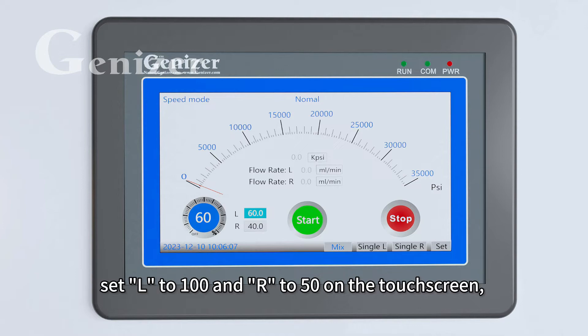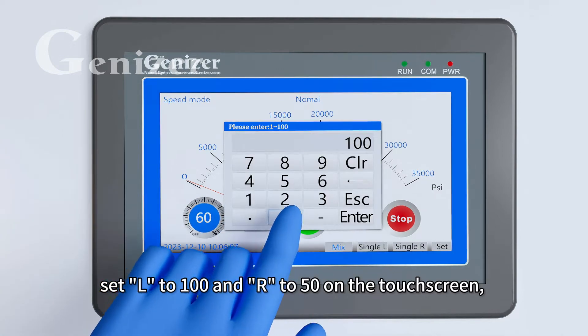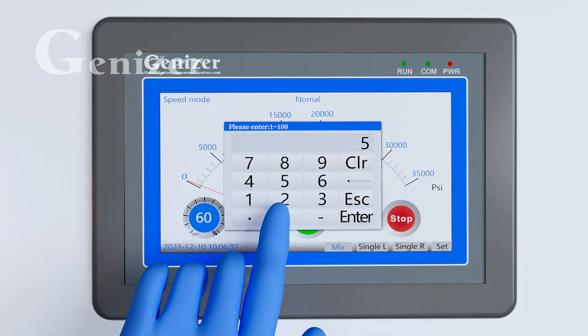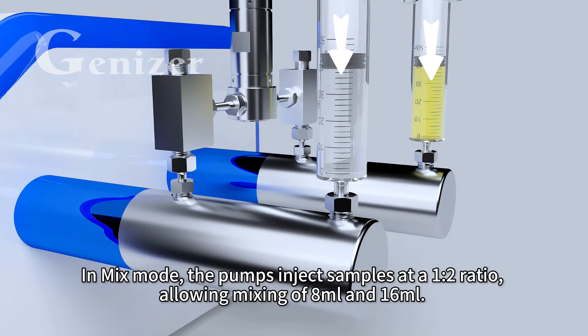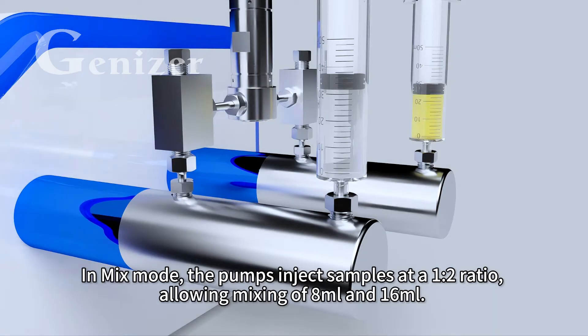Set L to 100 and R to 50 on the touchscreen, and press start to begin. In mix mode, the pumps inject samples at a one-to-two ratio, allowing mixing of 8 milliliters and 16 milliliters.